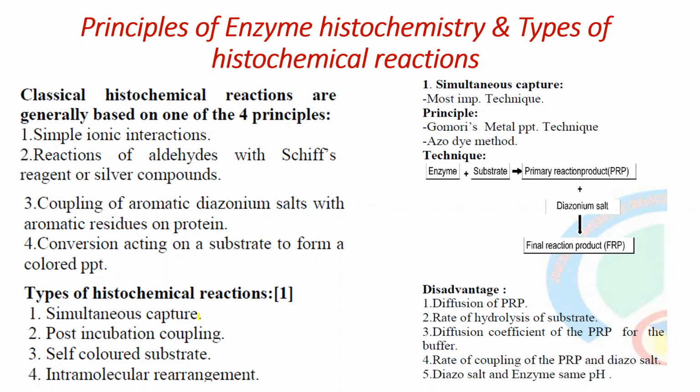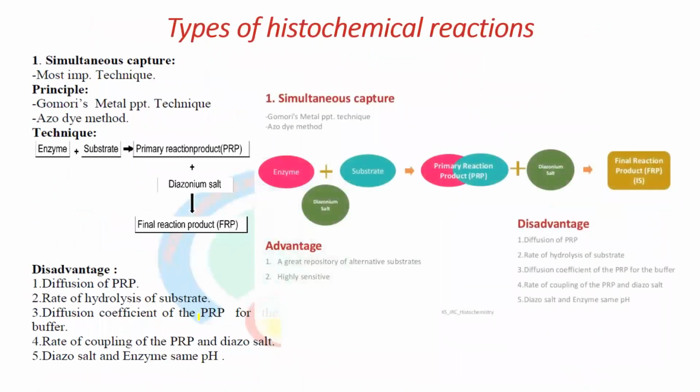So if there is a strong bonding, then we will go with this post incubation coupling approach. Post incubation coupling occurred within the tissue only, because there is a very strong interaction between the enzyme and the product. So that is why here we will subject it to a long time with the salt to develop the color. I cleared your doubt, right?